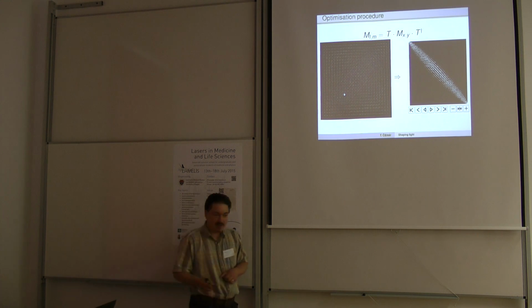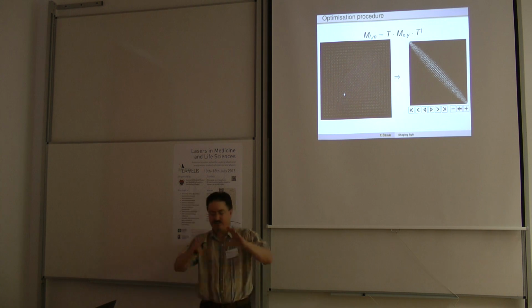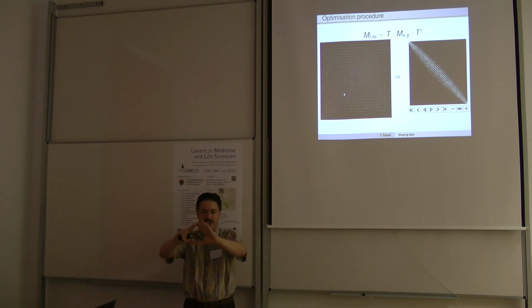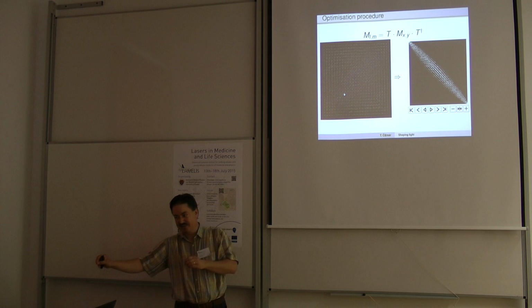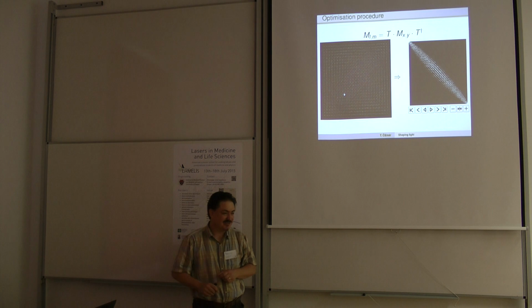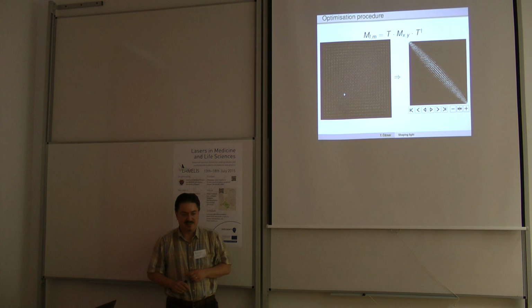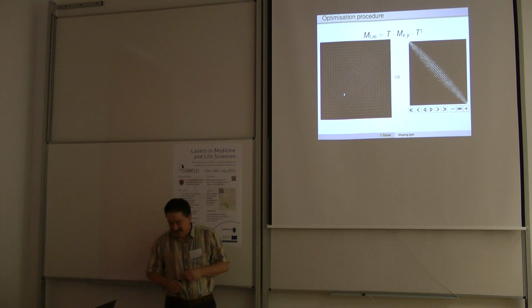And the problem was misalignment. If you consider how complex it is, you have a fiber that you have to align in X, Y, and Z, and two tilts, and one defocus. So you have 6 degrees of freedom on both sides of the fiber, so you have 12 degrees of freedom. There is no PhD student that can align that, I can guarantee. It's impossible, because it would take a couple of times the duration of the universe to do that. So the solution is to take the data and try to find this misalignment numerically in the computer.